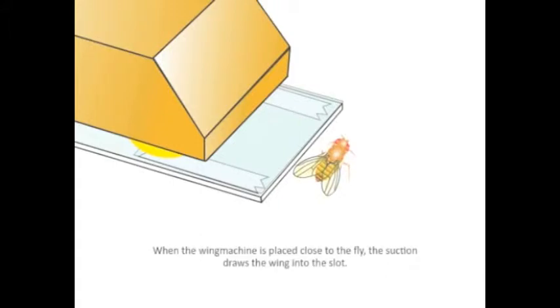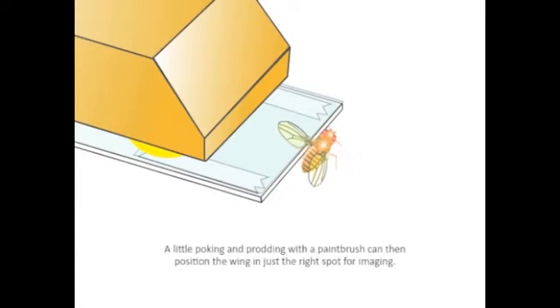When the Wing Machine is placed close to the fly, the suction draws the wing into the slot. A little poke and prod with a paint brush can then position the wing in just the right spot for imaging.